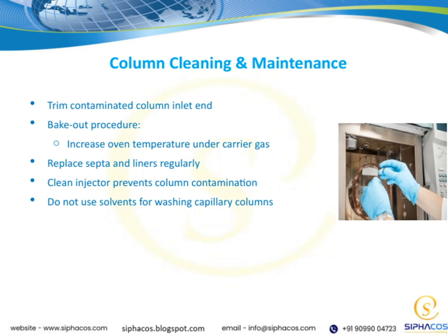It's also essential to replace septa and liners regularly. Over time, these components can degrade or become contaminated, which can compromise the integrity of your analysis. Keeping the injector clean is equally important. Regular cleaning prevents column contamination that could lead to poor separation or signal issues.